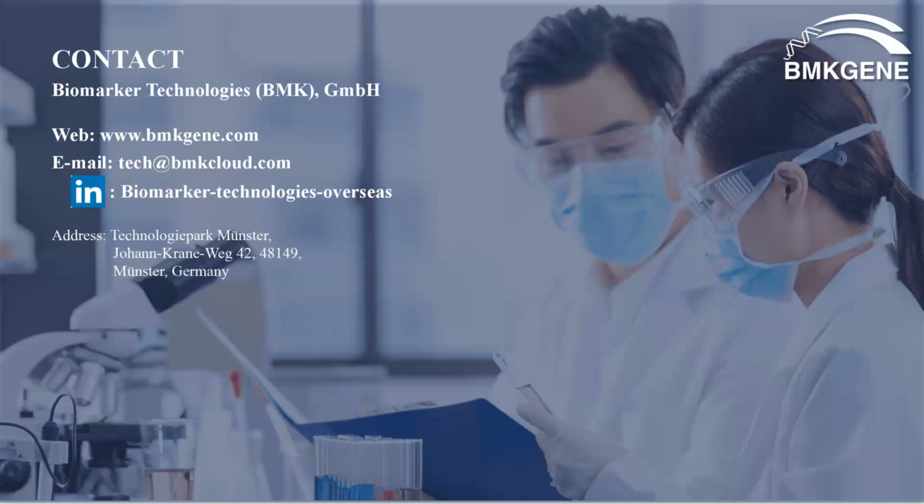And how do you filter the data to remove the sequences? So in the pipelines, I'm not really a bioinformatician here, so I'm not an expert in the analysis part. As far as I understand, once we do the data QC to remove any low quality data and also the adapter contamination, we will align the reads to the reference genome and then use this data to do the expression quantification.